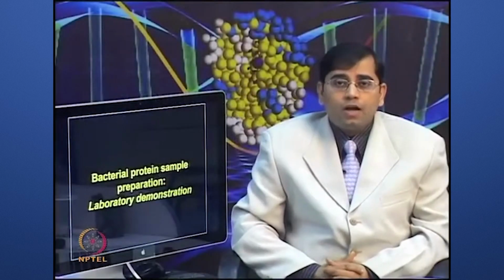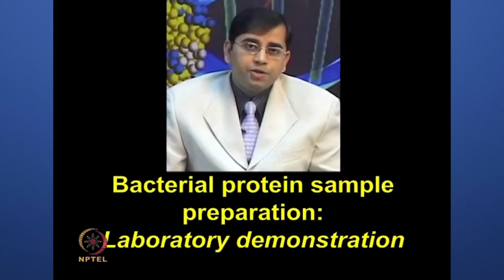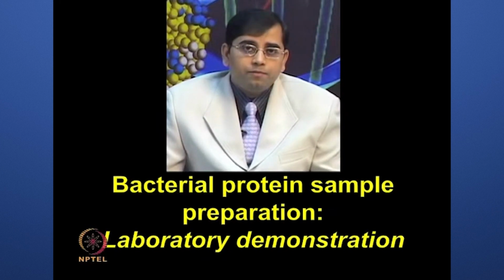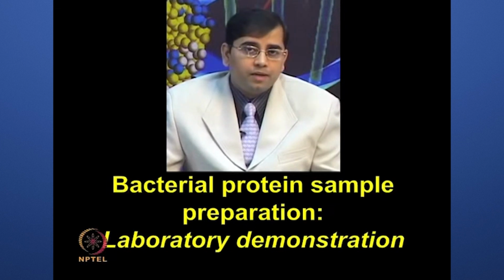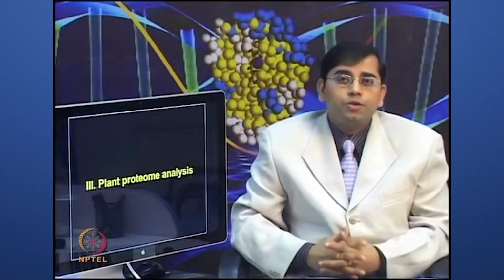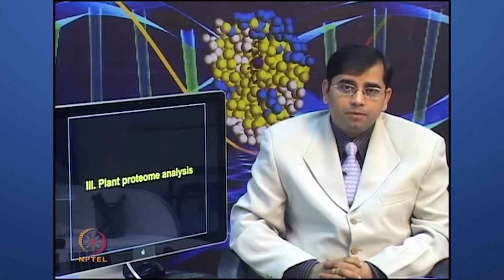Okay, so I hope this video was informative and now you are able to appreciate the complexity involved in this procedure, as well as how useful this method can be for different types of biomolecule extraction including DNA and RNA, and how protein can get rid of various types of contaminants by using the trizol method. So, now let us move on to the plant proteome analysis, the third specific example.